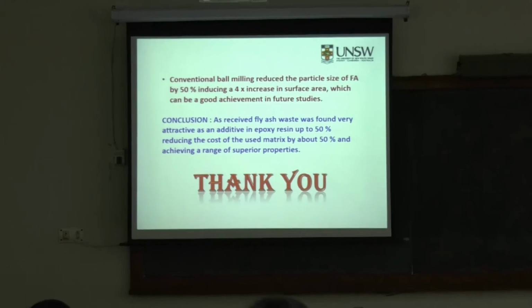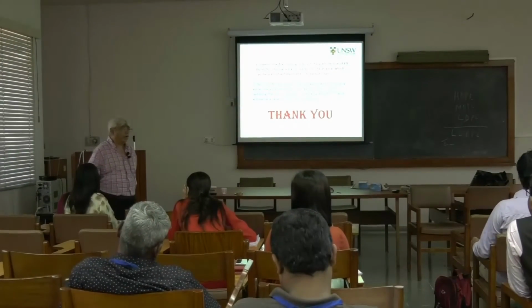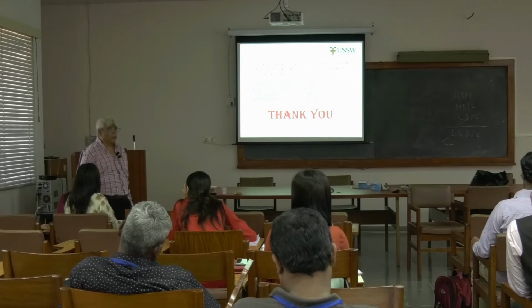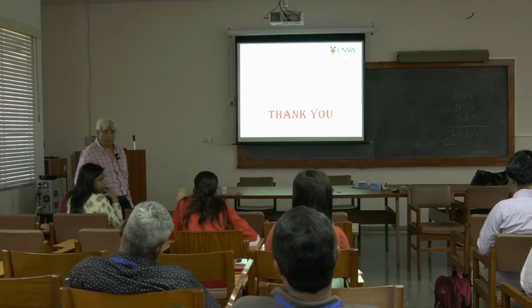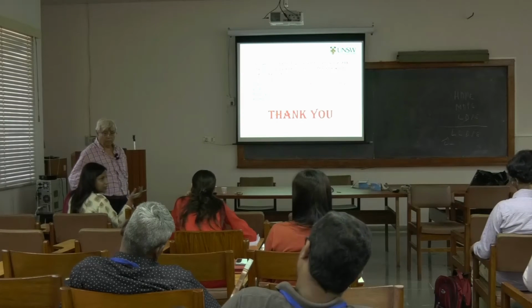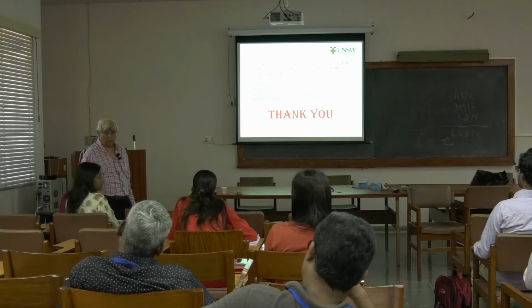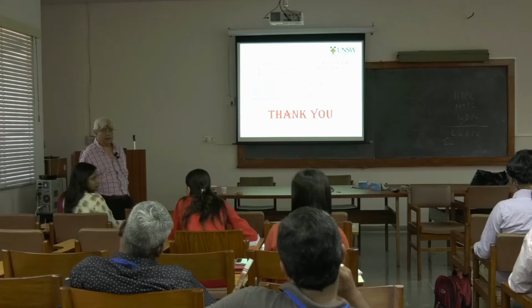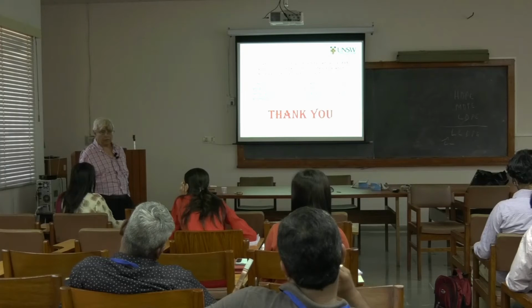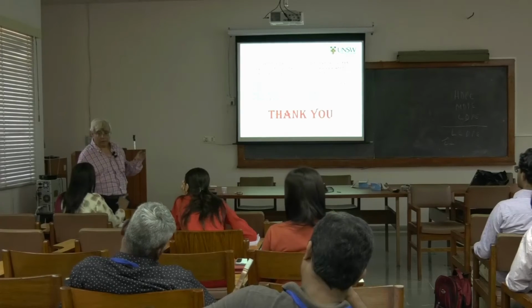Can you speak louder? Everyone can hear. Why intensity of each peak is coming down? Maybe it may be that it is intensity. I think it depends on the intensity. Intensity is related to the concentration of the particles, I think.